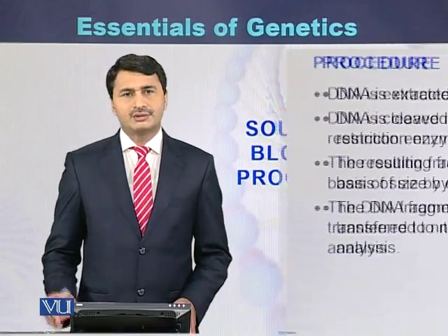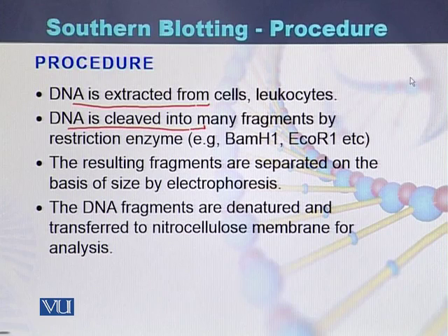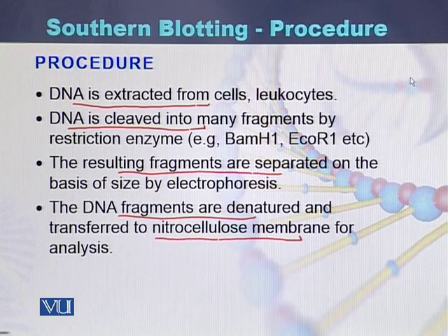Southern blotting procedure. The procedure used to perform the technique Southern blotting is that first of all, DNA is extracted from the cells. Once DNA is purified or extracted from the cells, this DNA is cleaved with the help of restriction enzymes. After the restriction enzyme digestion, the resulting fragments are separated on the basis of their size by using electrophoresis. The DNA fragments are denatured and transferred to nitrocellulose membrane for the analysis.